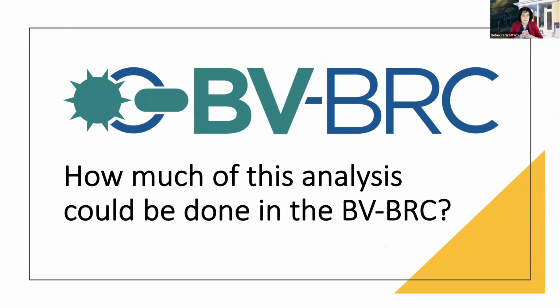So if you've taken my other webinar in this series, and I'll be doing 2 more too, in each of these I explore what could I replicate in BV-BRC.